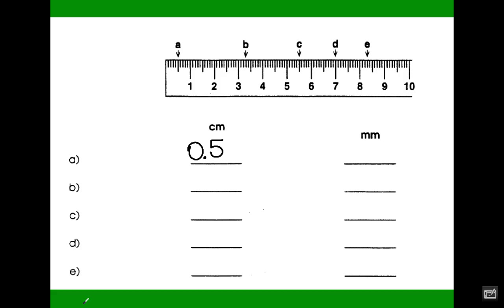In fact, I think it's pointing directly at the line, so it's not above or below. So my guess will show that. This tells me that I have gone past 5 millimeter markings and that it's right on the line with that 0. Okay. If we look at letter B, it's slightly different.